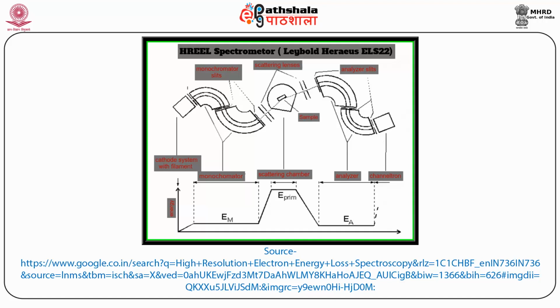As the electrons used for HREELS are of very low energy, they have a very short mean free path length not only in the sample material, but also under normal atmospheric conditions. Therefore, one has to set up the spectrometer in UHV conditions. The spectrometer is in general a computer simulated design that optimizes the resolution while keeping an acceptable electron flux.